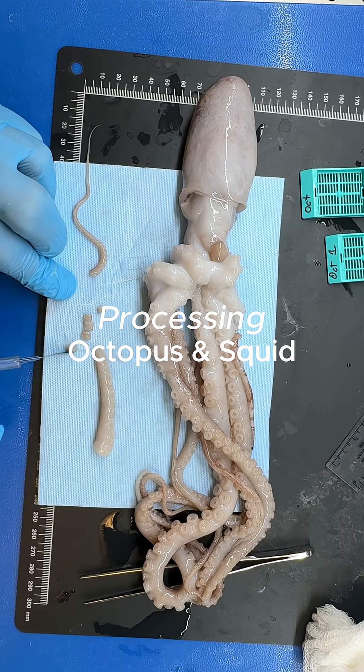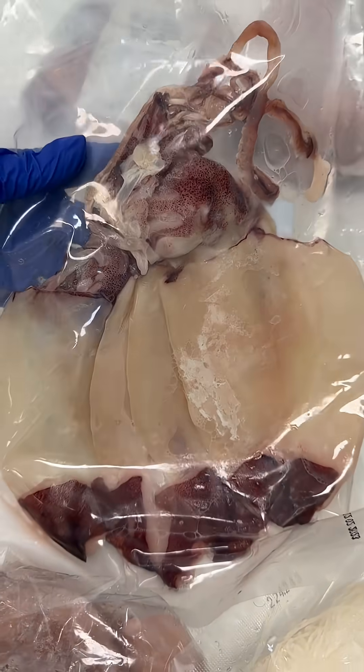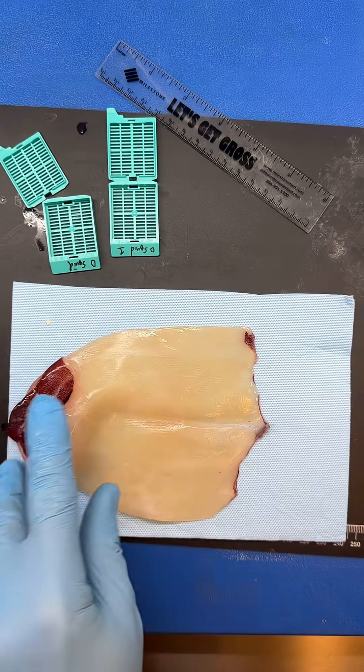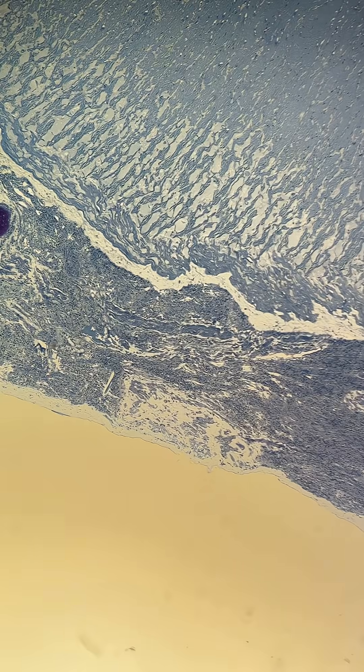This is probably one of the worst experiences we've had doing one of these processing videos, but nonetheless we pushed through. Today we're going to show you how we processed squid and octopus to look at them under the microscope.